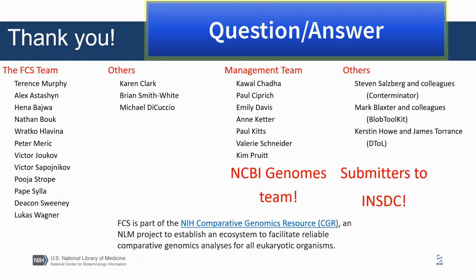And as far as the organisms, there are just not as many tools out there that specifically operate on reads. So this is, again, something that we think is new territory in a lot of respects. And it also operates very quickly, so it has that high throughput component that we're excited about.